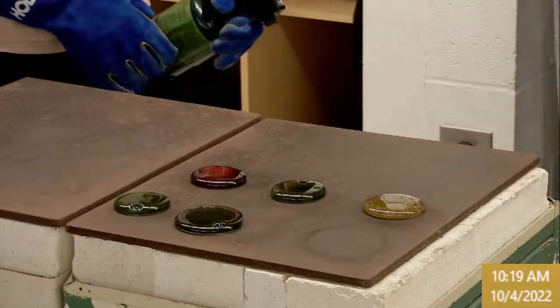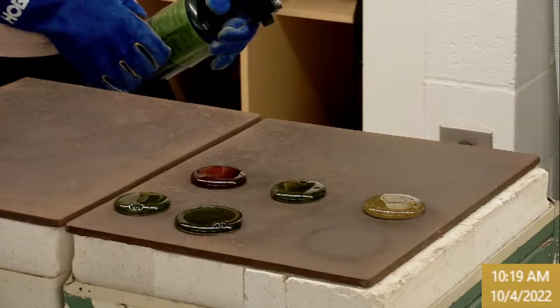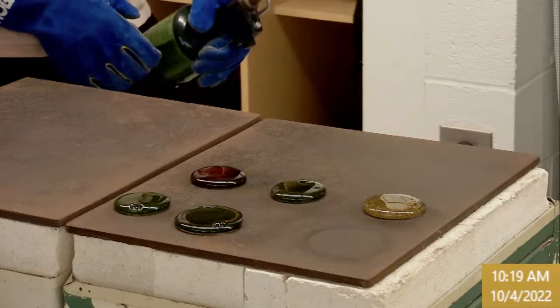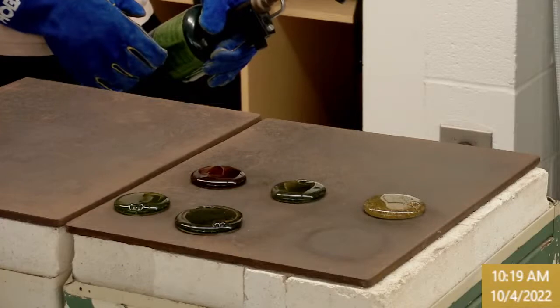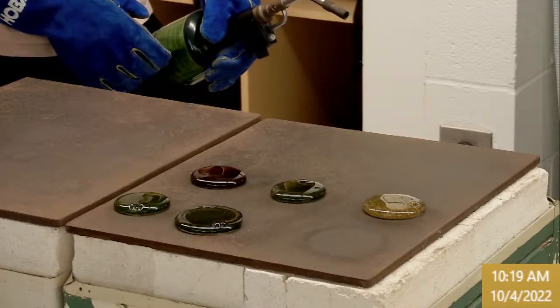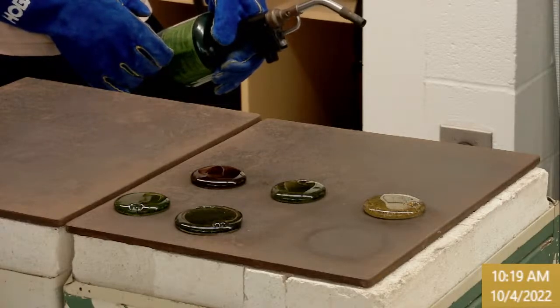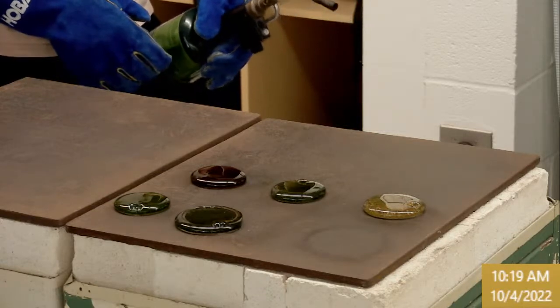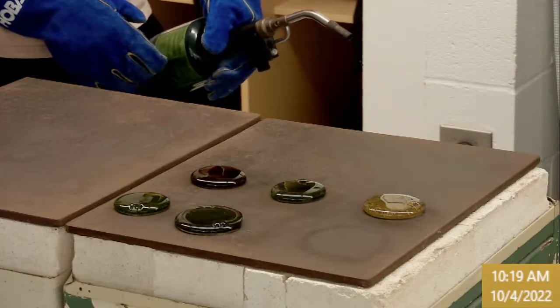The next one is composition G. This is a Fischer silica. I think this might be our first example of a high purity silica. So Fischer silica, sodium carbonate, calcium carbonate, 52:26, pretty standard. Slightly higher on the flux loading, just a little bit. And 0.1 grams of manganese. So this one, because we're using the pure silica, should hopefully be our truest purple color, since there's not a lot of iron.